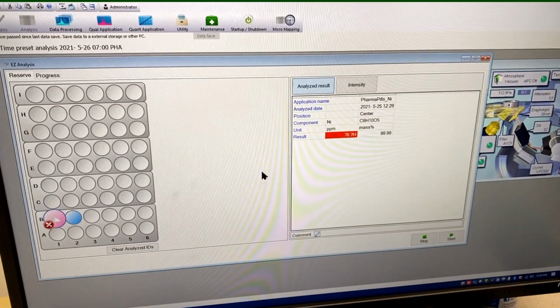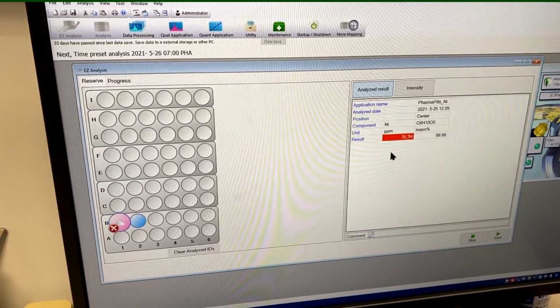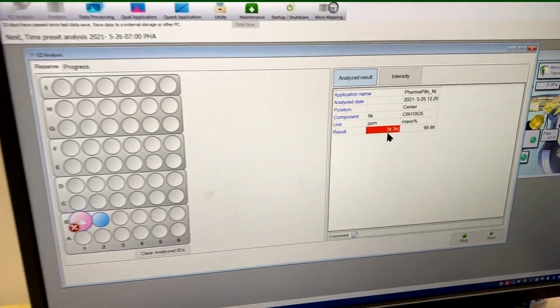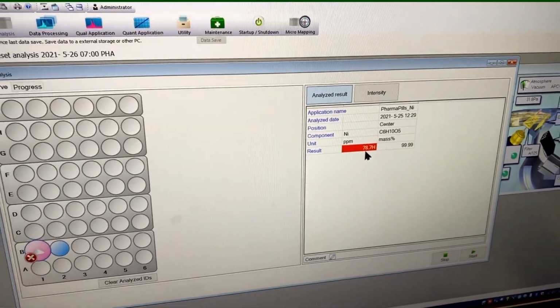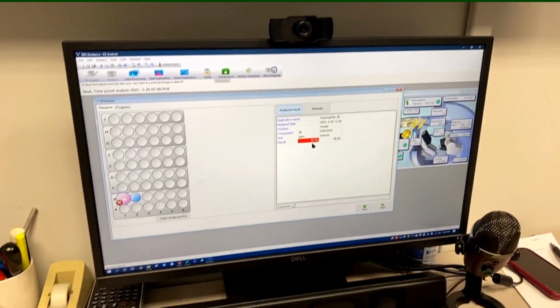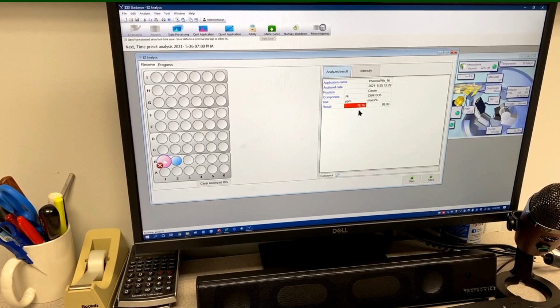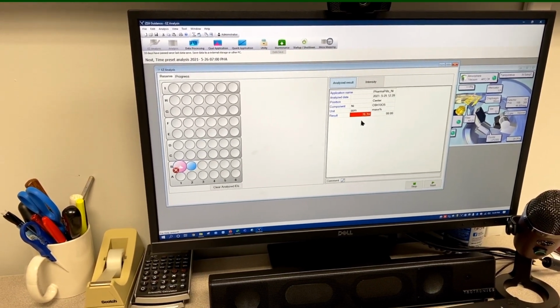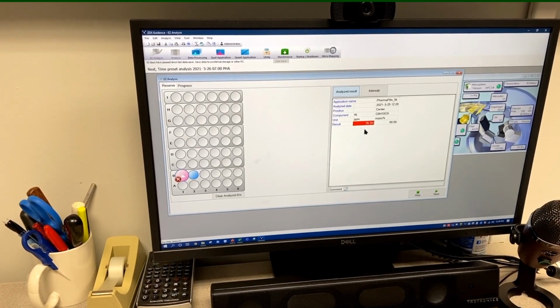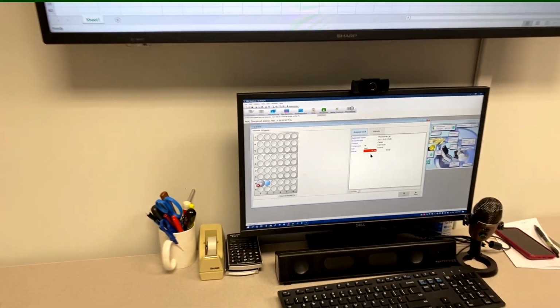So the results here have been done. As you can see, because we had set our limits between, I believe, 30 and 50, this one should be around 80. You can see it's above the limit, and it's at almost 79 ppm. Our actual sample that we made in an oblong shape is 80 ppm. We're getting 79 ppm with a different shape than we've actually analyzed. And all we had to do is pour the pills into the cup.